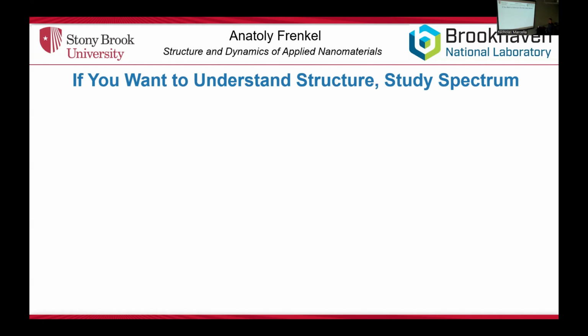And I will simply cover the basic concepts of why we need XAFS, why we need X-ray absorption spectroscopy in general, for what applications, what the scientific drivers are for that, and show some examples of how to pose the problem, how to go about solving it, and what the challenges are. It will be impossible to use it as any kind of practical tool, but it will put you in the right frame of mind, I hope.